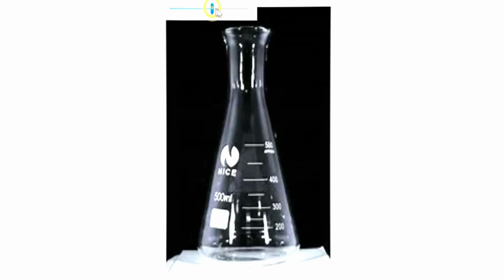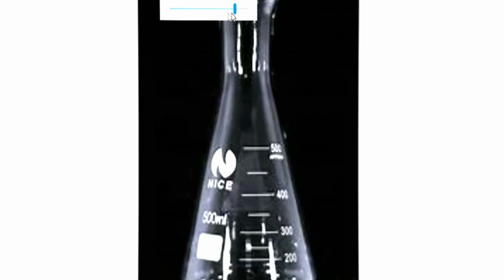Another apparatus is the retort stand to support the burette. That is our retort stand. Another apparatus you can see is the conical flask, to be placed below the burette. Here is a conical flask with readings, and here is another conical flask.